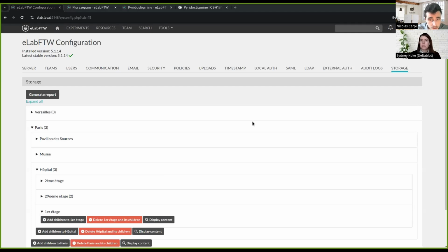So the SDS files are provided by the reseller, by Sigma Aldrich, for instance. On PubChem, there is no such information. There is information, but it's compiled from other databases and it's associated with a degree of trust. So basically, the real safety data sheet is the one that the entity that sold you that chemical tells you how it is. Because it depends on the purity, it depends on many aspects. So no, we cannot import it automatically.